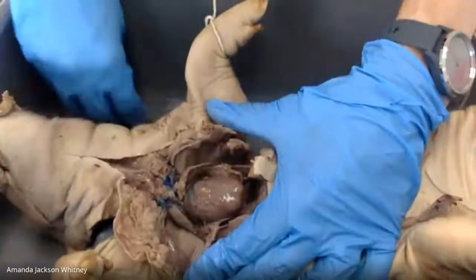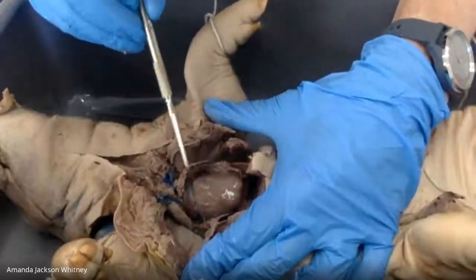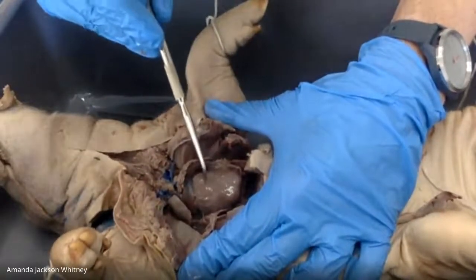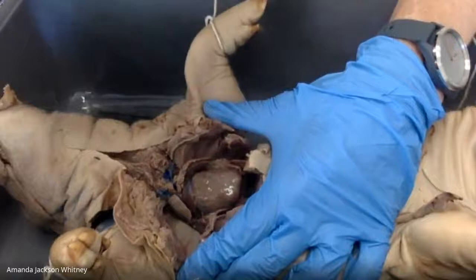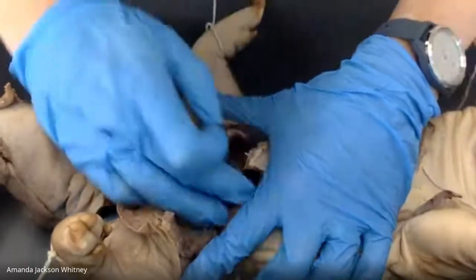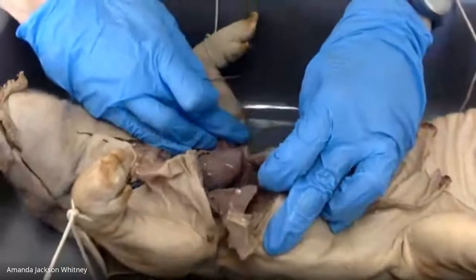Okay. So before I really start to go to town in here, this right here, what do you guys think this is here in the center? Is that not the heart? Yeah, that's the heart, exactly. That's what all that tissue was surrounding, is the heart. And then on either side of the heart are the lungs.